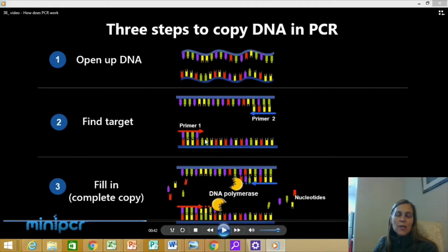So just to notice here that you're actually, some of the chemicals in your tubes that you're going to receive, one of them is a primer. So you're going to actually put primer into your DNA to cause it to start to find that.